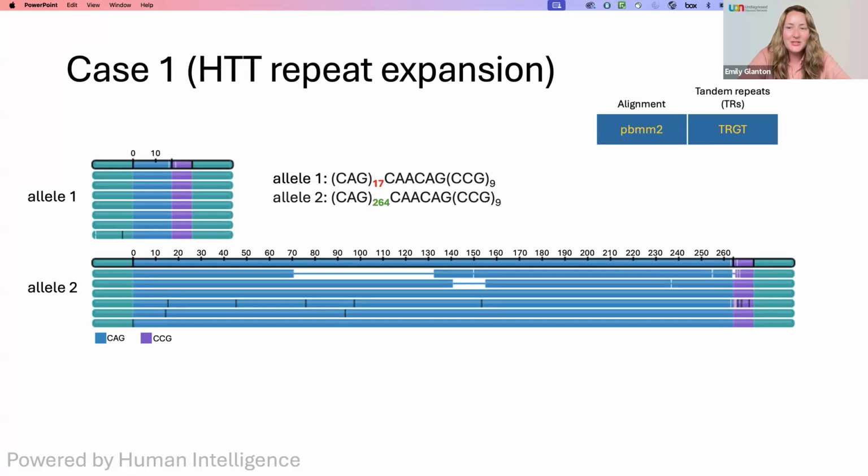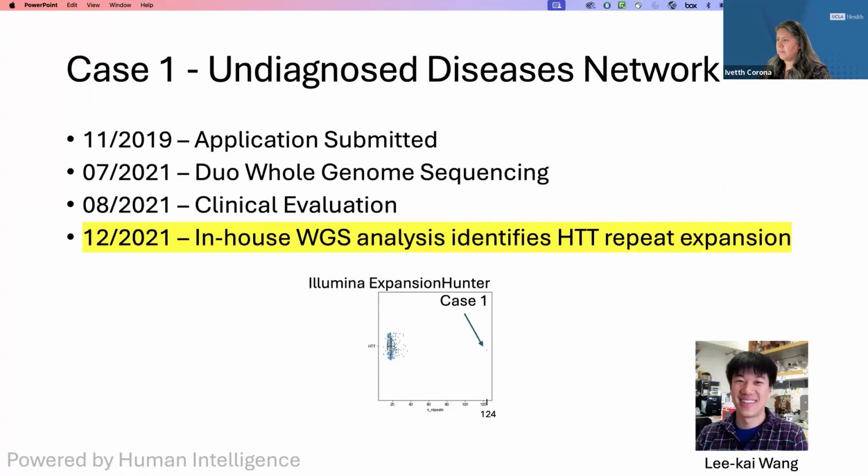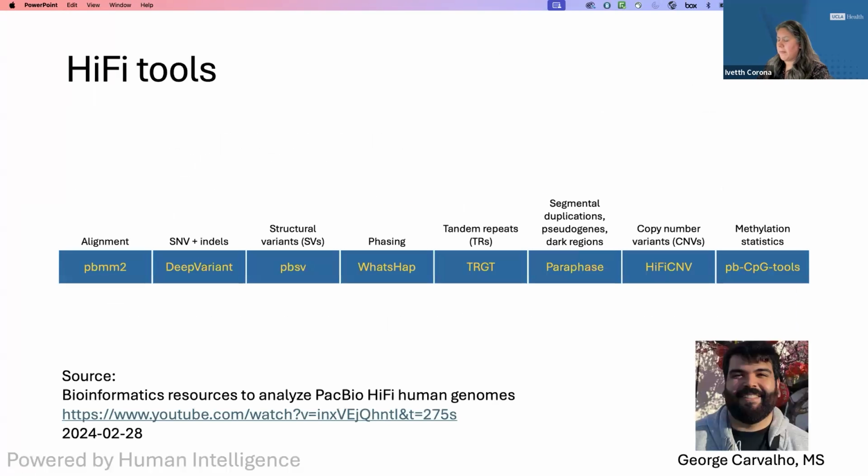All right. So the next question is if you can comment on any software that you are using for SNV or copy number variant interpretation. Yes, so let me show you the pipeline. This is the pipeline that we're using.